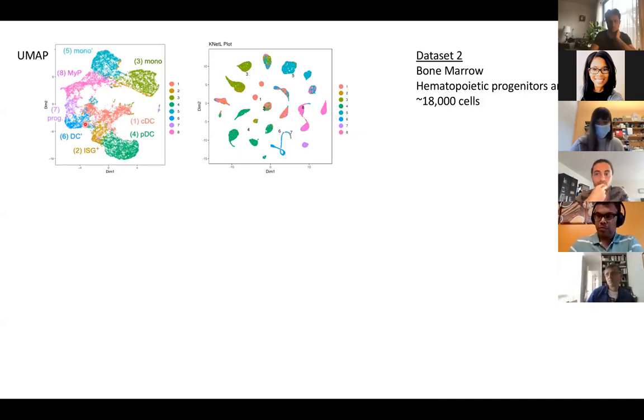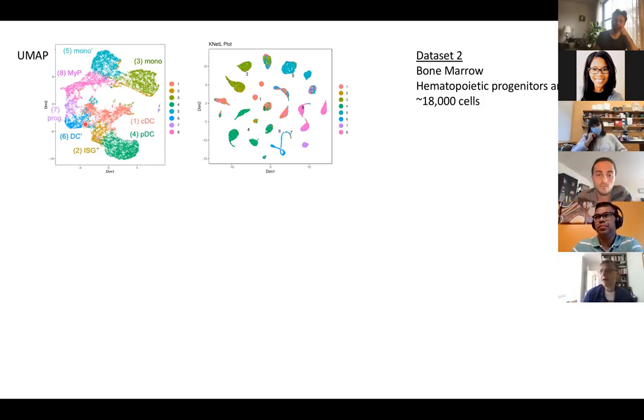So it looks like then you can use this analysis potentially instead of using CITE-seq. Is that true? Oh, no. To clarify, CITE-seq is the technical approach to generate the data. And what we're talking about now is understanding the best algorithm to use. But you're including the antibody data, so CITE-seq includes antibodies. So this data includes antibodies and RNA. Is that what you're saying? Yeah, so actually the clustering itself though is based solely on the RNA transcripts. We don't use the antibody tags for clustering purposes.